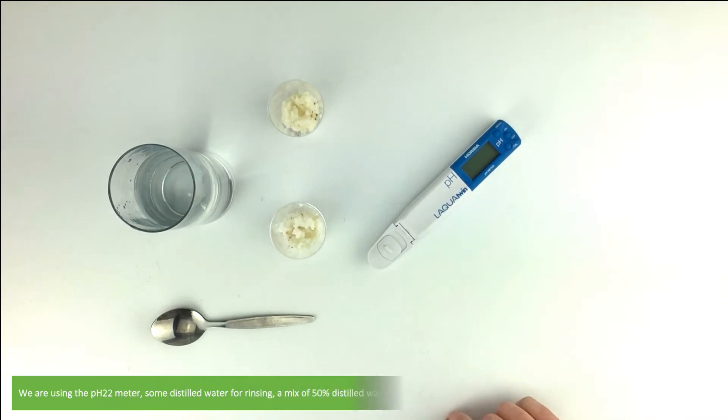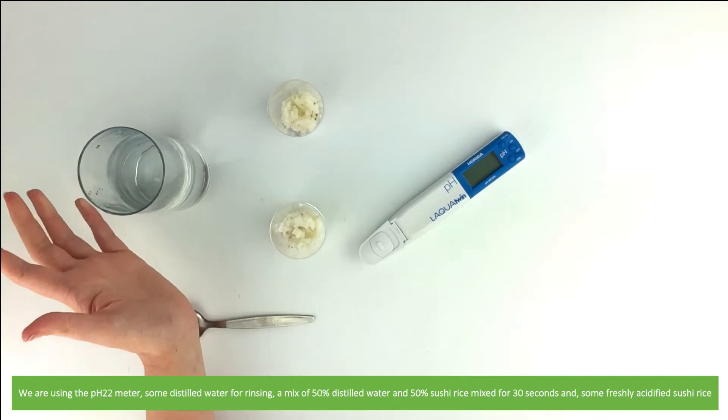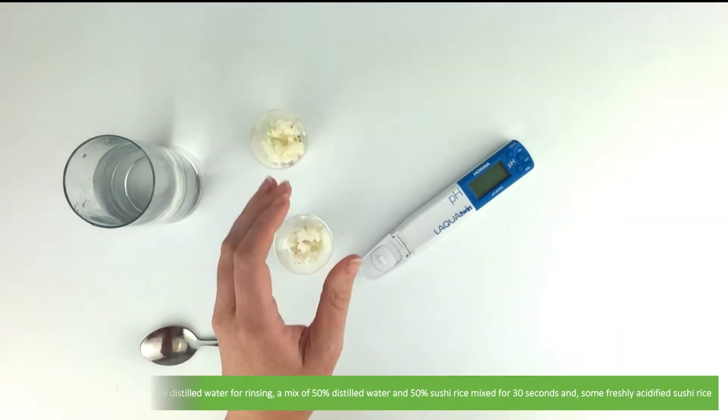We have the pH 22 meter, some distilled water for rinsing, a mix of 50% distilled water and 50% sushi rice mixed for 30 seconds, and some freshly acidified sushi rice.